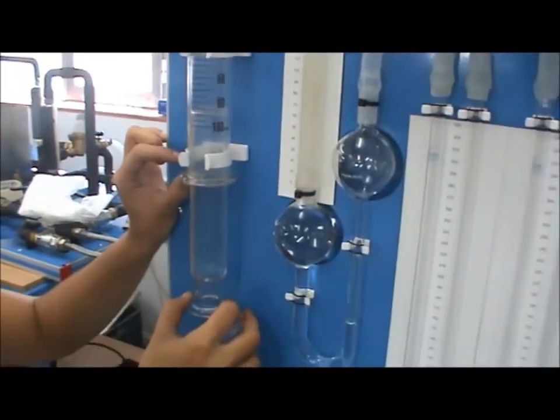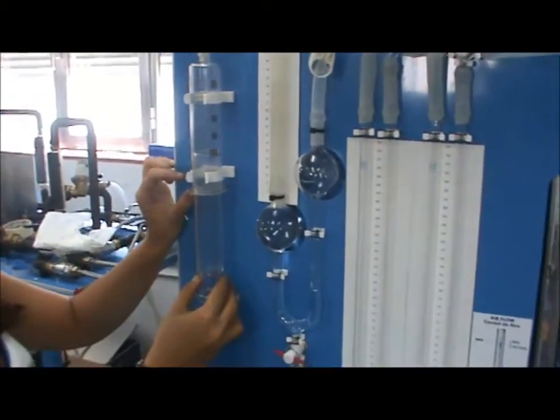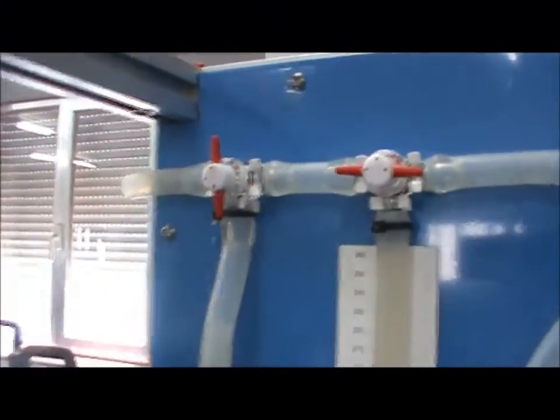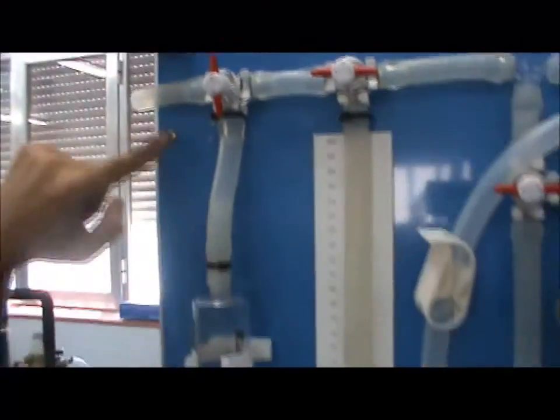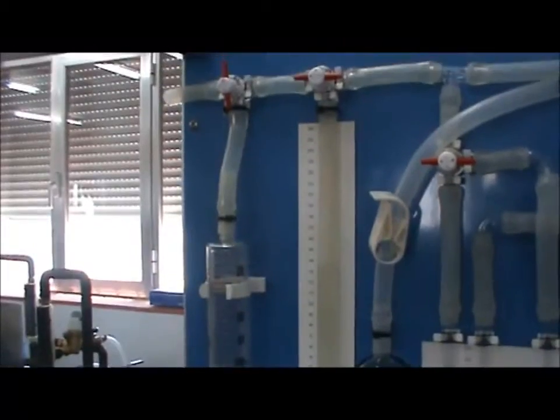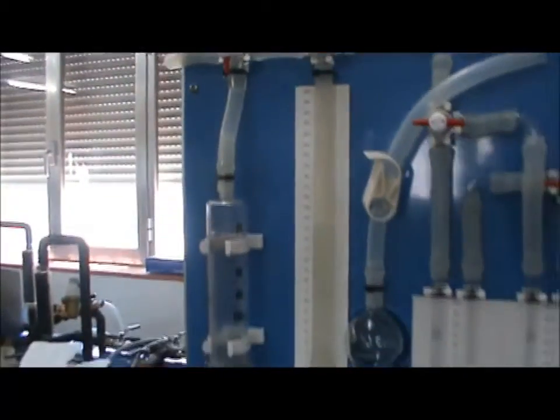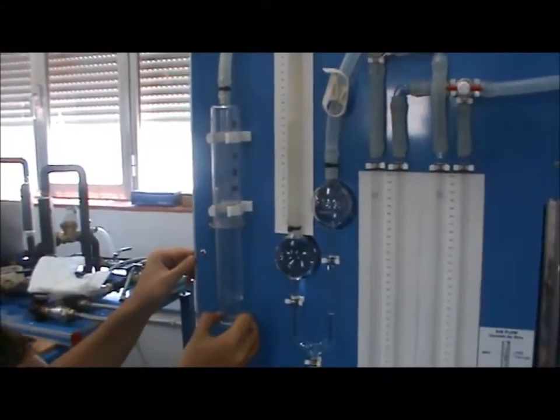Now, push the plunger down, drawing the air mixture from the column into the syringe. Turn valve VT3 to expel the sample to the atmosphere. Repeat these steps five to six times to clear the lines and to ensure that the sample is representative of the mixture in the column.